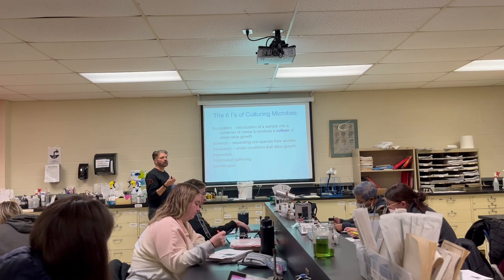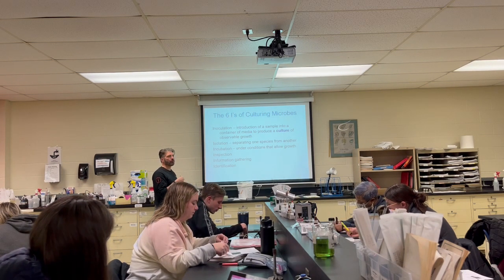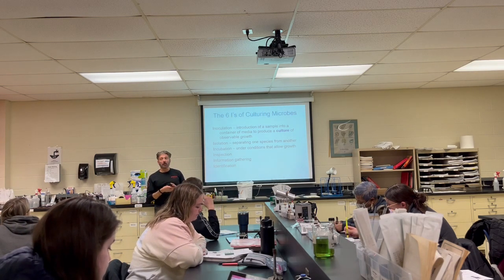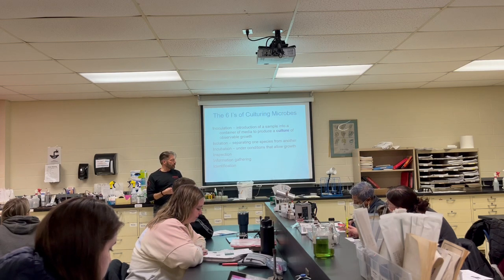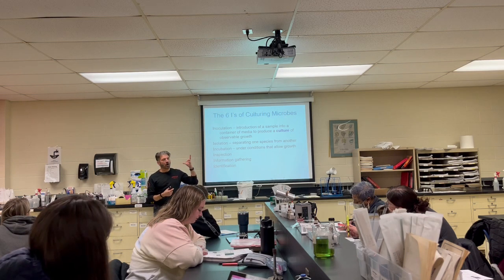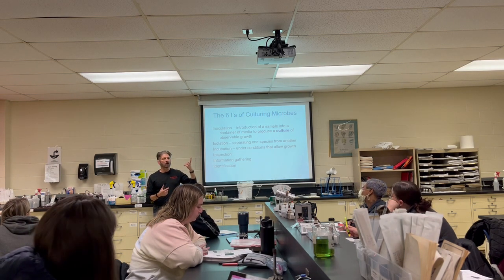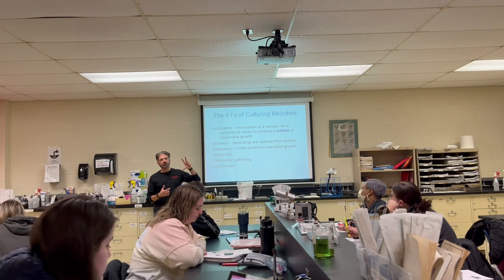So if I swab something and I put it into a nutrient broth or on a plate, I should expect something to grow. Right? Please realize if I have a nutrient broth and it's clear, and something is growing in it a week later, should I expect that the viscosity or the color of that tube will probably change?